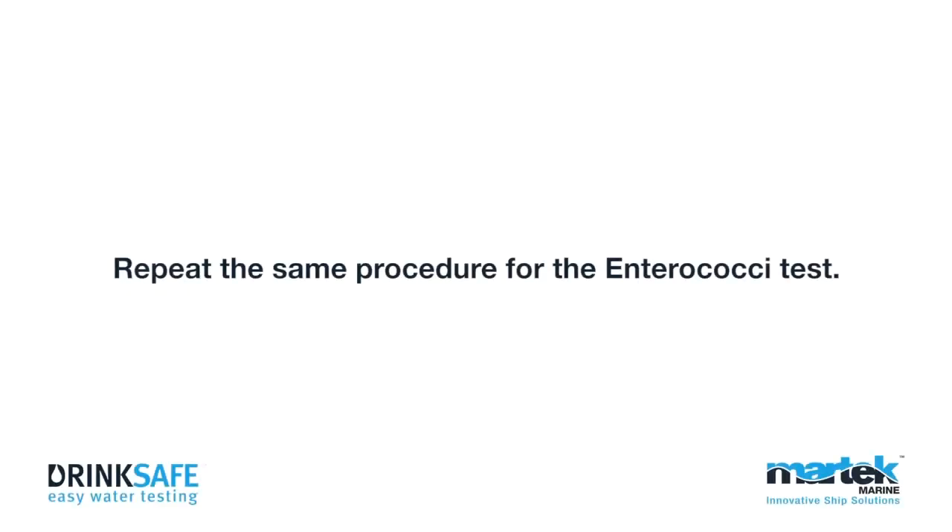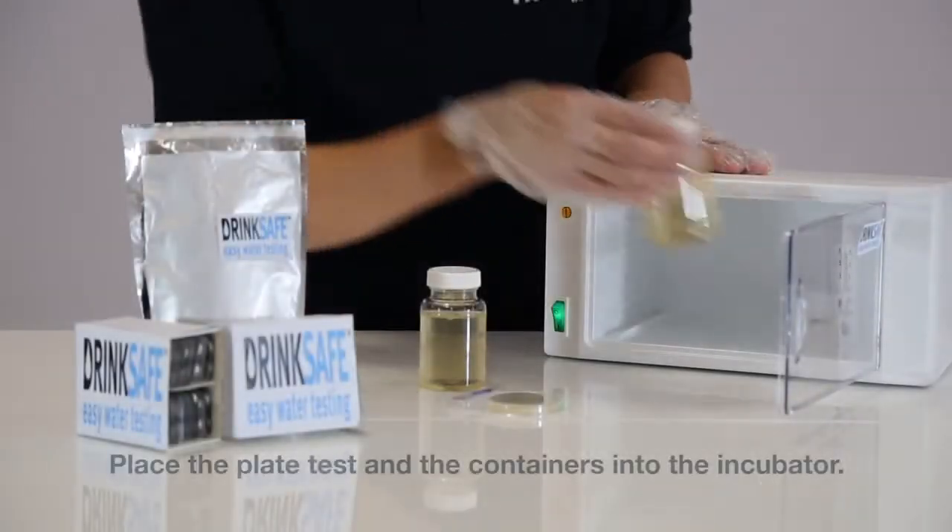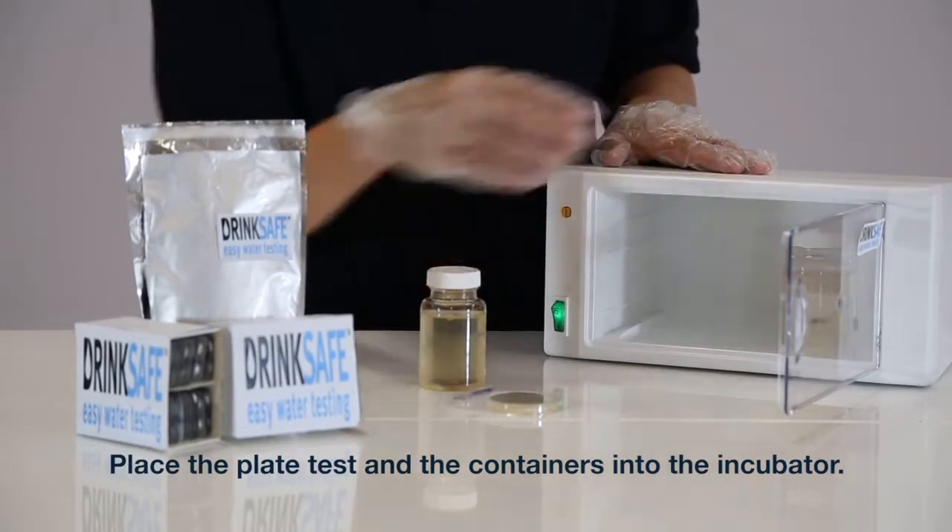Repeat the same procedure for the enterococci test. Place the plate test and the containers into the incubator.